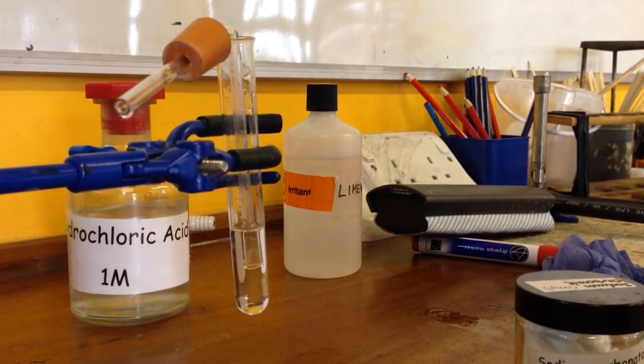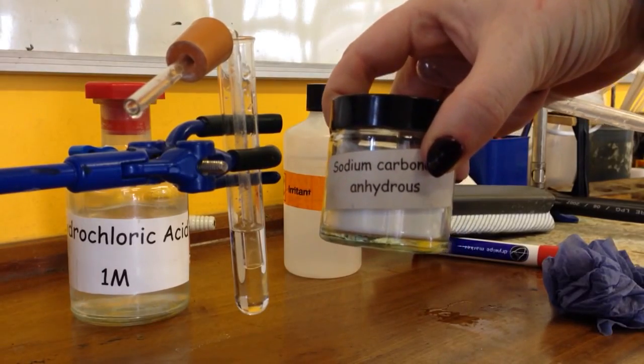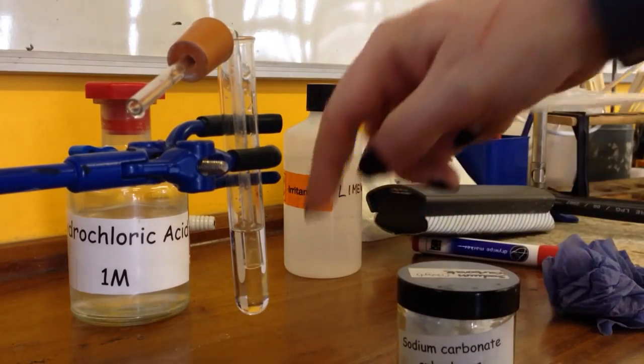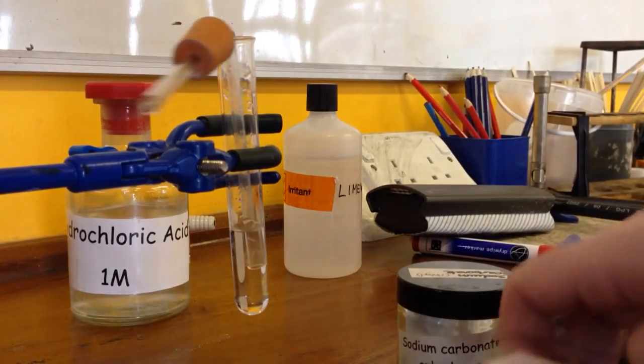So here we're going to be looking at the test for carbonate ions. I'm going to be testing sodium carbonate, so that's carbonate ions in. Here I have a beaker which has lime water in and a delivery tube into the beaker.